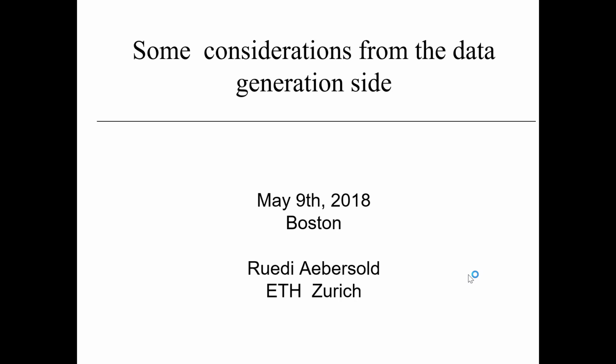The thing about DIA and SWATH is that the data files are quite large, so we have some toy data files that we're going to let you play with, and then some fully processed files, which actually get to be fairly large as well. So you're going to need disk space. If you don't have very much memory, toward the end you're going to have to buddy up, but for the first day you'll probably be okay.